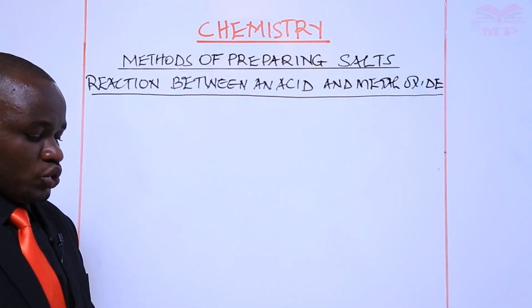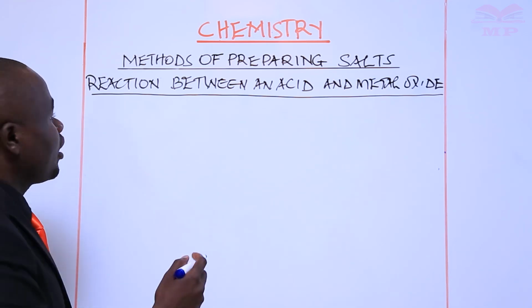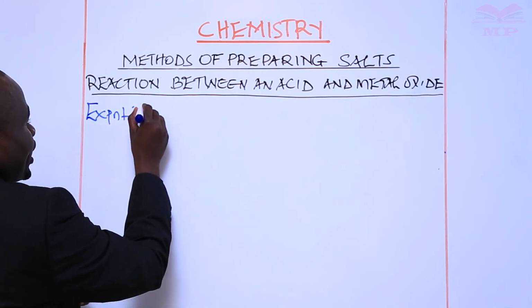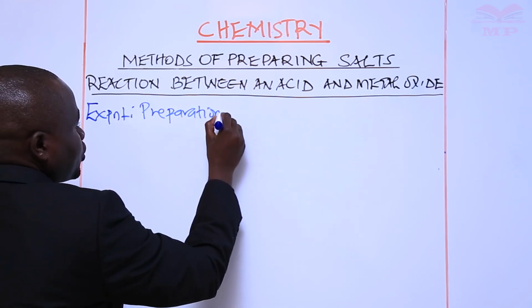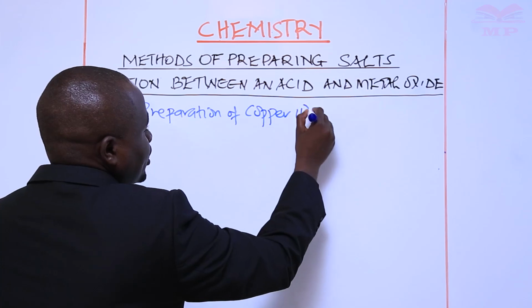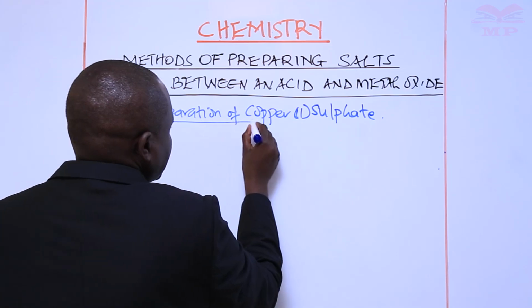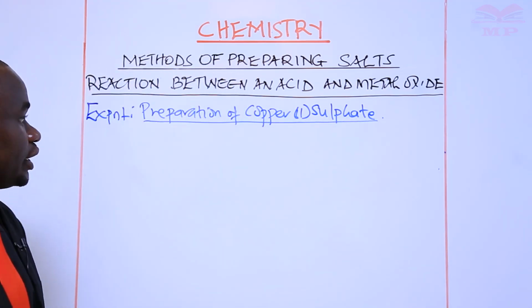So we are going to consider a brief experiment here. We are going to look at the preparation of copper sulfate. That will be our basis of today's discussion.